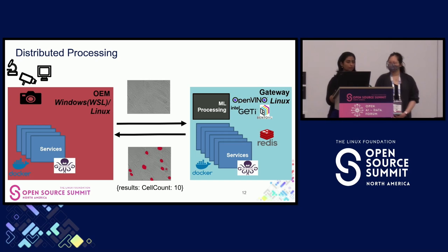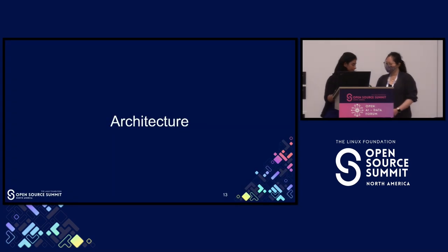So we can see all our services are microservices based. It's built on top of EdgeX, and they are all Dockerized and running on two separate systems here. Now let me hand it over to Elizabeth, who will cover the architecture.